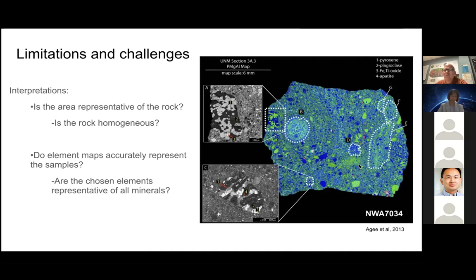Now we can see there's some areas that are circled in these white hash marked lines, and those are regions showing obviously different textures and potentially different chemical compositions, at least based on the elements picked in this map, as well as different shapes of particles. This is a volcanic spherule. And then in these inset electron images, we're actually seeing fragments of different rock types.